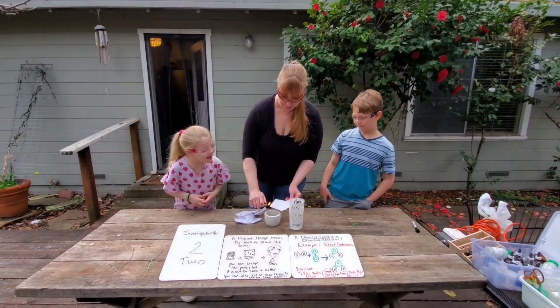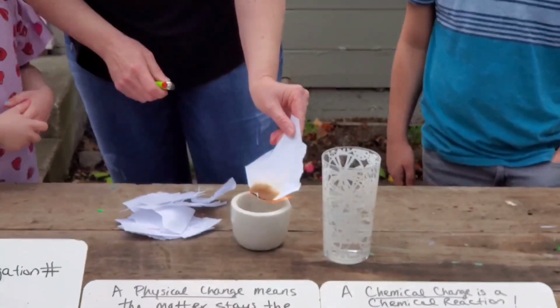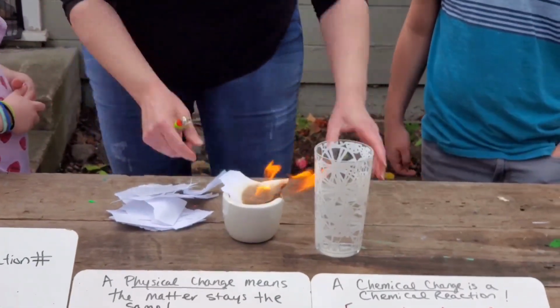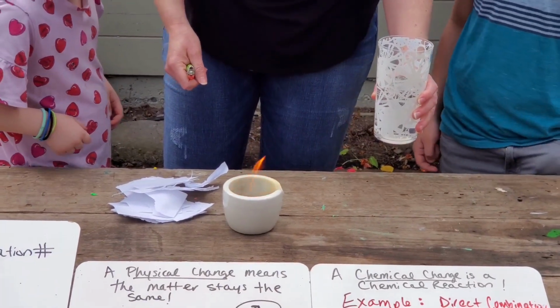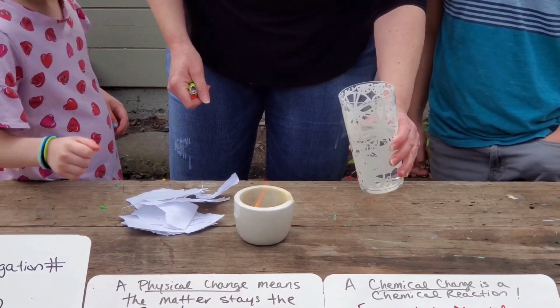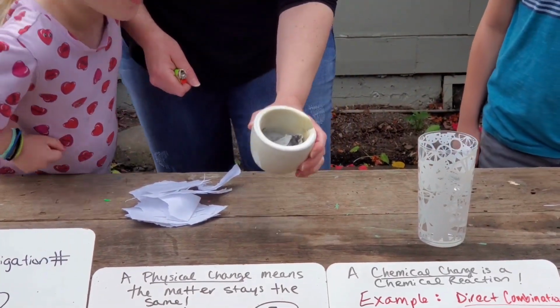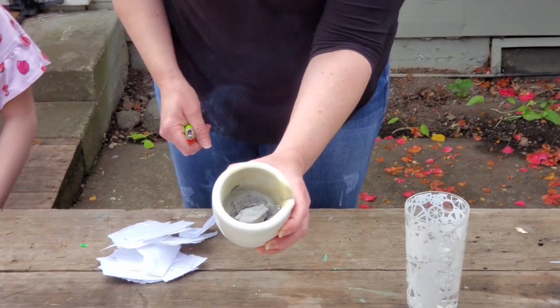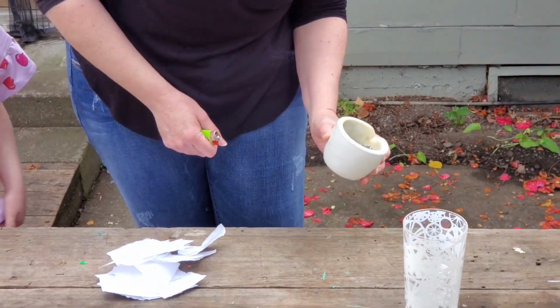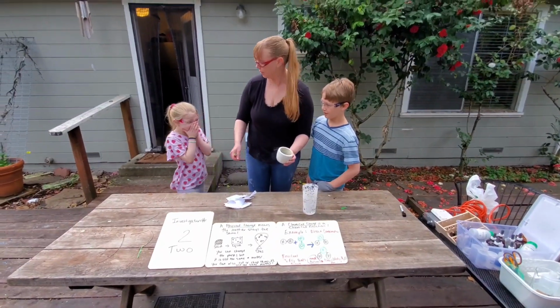Then, here we go. What are we seeing happen? Turn into brown. Okay, we're good. Go ahead and show them. Logan, my son, is doing the video. What color? Qualitative. What do you guys think? Brown and black, charred.